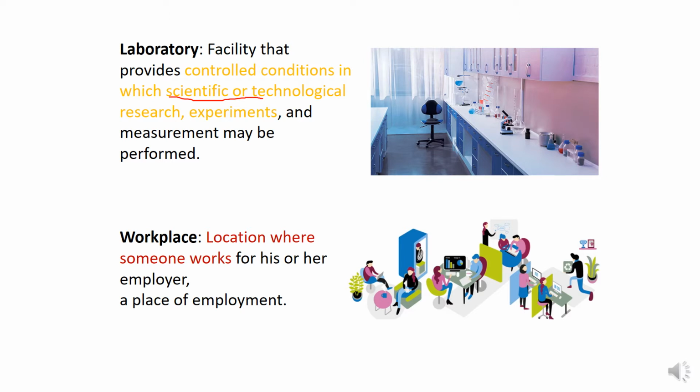So the only difference between a normal room and a lab is the conditions, because of course there are different pathogens we are working with, and we need to get disinfection for those pathogens, for example fungal or bacterial pathogens, as well as some viral pathogens. So laboratories are basically controlled conditions where we can perform different experiments.